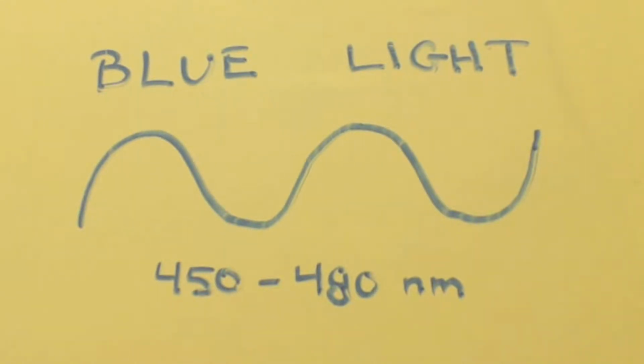As promised, I'm going to tell you how to make blue light between 450 and 480 nanometers. As we discussed in the last series of videos called benzyl chloride via free radical halogenation, we need between 421 and 494 nanometers.